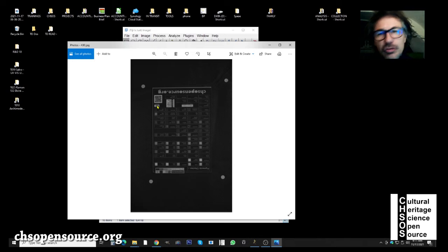This registration is done to take into account that the camera could be shaken while changing the filter, or in any case, since we need to refocus because we are using a normal lens in our camera, when you do the refocusing, the dimension of the area that you are photographing changes.